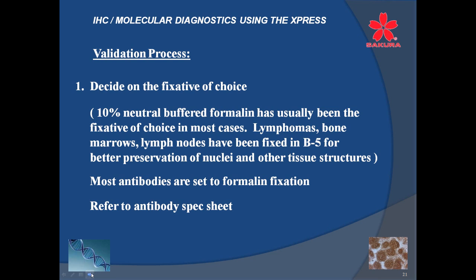Most antibodies are set to formalin fixation. If you look at your antibody spec sheet, it will usually have an area for a fixative, and it will more than likely say formalin. More of them do than not. Some may not include that, but for the most part, it surely is there to recommend the fixation treatment.